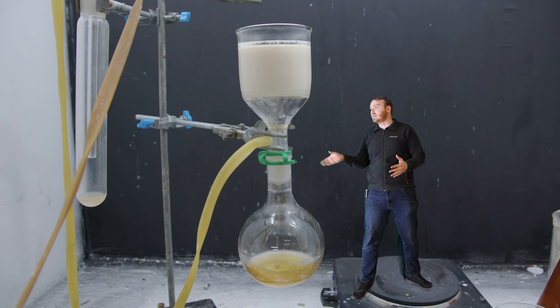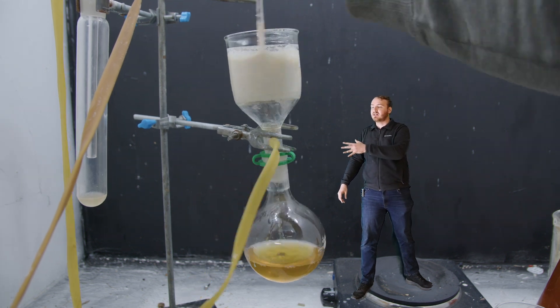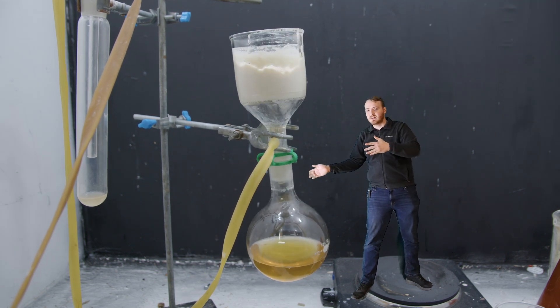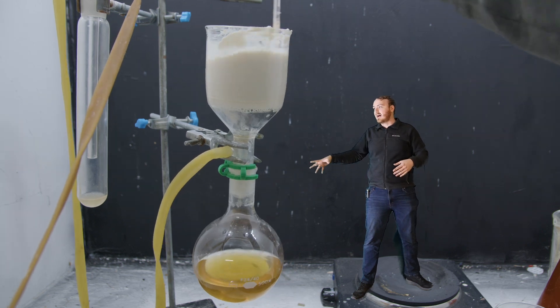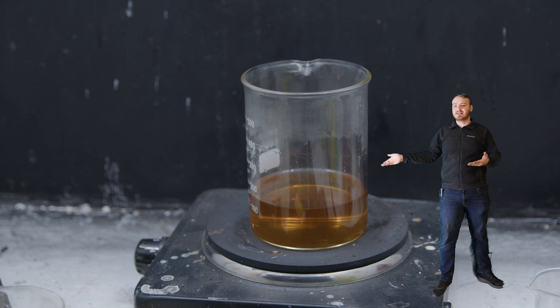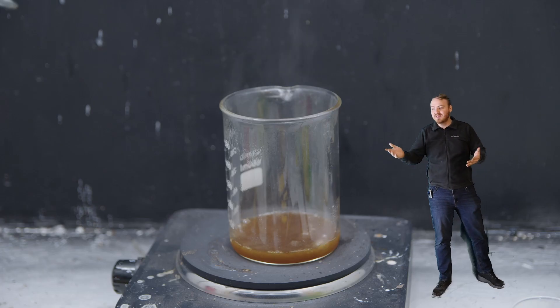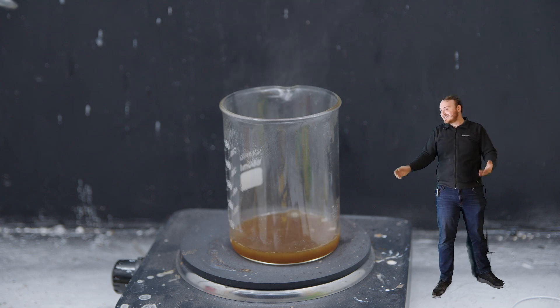Once we think the reaction is good and done, we can filter off the solid calcium sulfate and it'll get stuck in the filter. And then all of the citric acid pours down in the water because it's all dissolved. So now what we have is just pure citric acid and water. So if we just boil off the water, then we'll be left with pure citric acid.